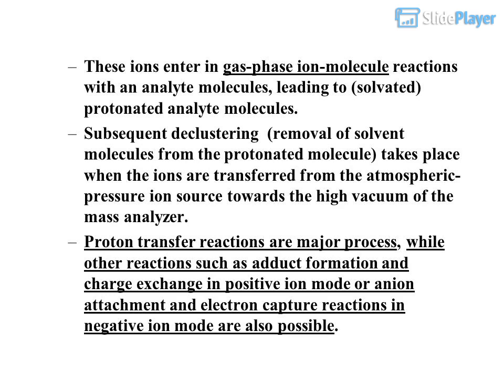Subsequent declustering, removal of solvent molecules from the protonated molecule, takes place when the ions are transferred from the atmospheric pressure ion source towards the high vacuum of the mass analyzer. Proton transfer reactions are the major process, while other reactions such as adduct formation and charge exchange in positive ion mode, or anion attachment and electron capture reactions in negative ion mode, are also possible.